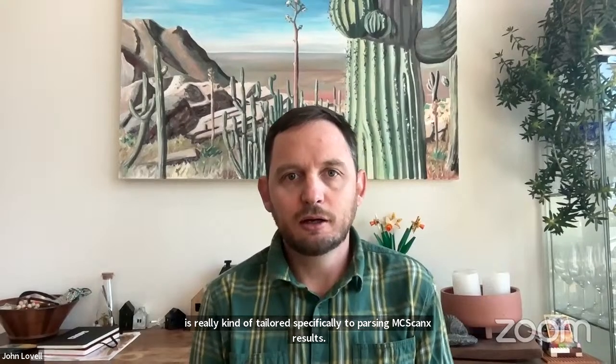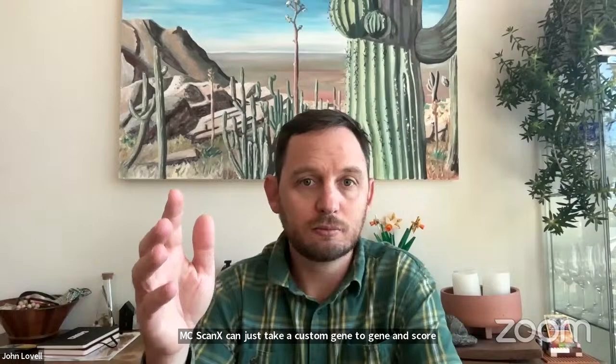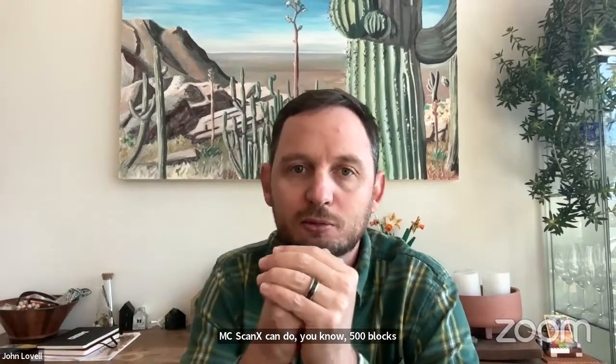Well, all right, I'll answer those last two questions really effectively. So Genespace is definitely designed to only parse MC ScanX output. And the main reason for that is because MC-ScanX can just take a custom gene-to-gene and score data set. You don't need all this other stuff. And so one thing that Genespace can do is run MC-ScanX within blocks. And some of these other software have a lot of overhead. MC-ScanX can do 500 blocks really, really fast just by passing these small strings to it. So that's why we use MC-ScanX.